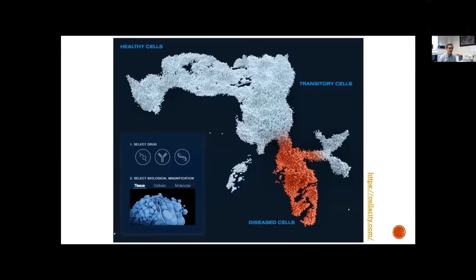across many individual cells. This is a picture from the company. They're using single-cell technology to study disease mechanism. This is a very good illustration because what you see is this: each dot here will be a cell. And this bar on the top indicates the expression level of certain genes.